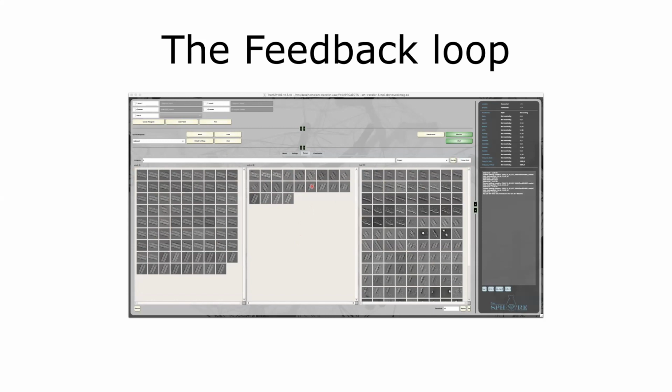Usually I would also put those here in the bad category, because you can see the mask is cutting very harshly inside of those. Once you have made this selection, you click on retrain, and it will retrain automatically on those good and bad class averages.